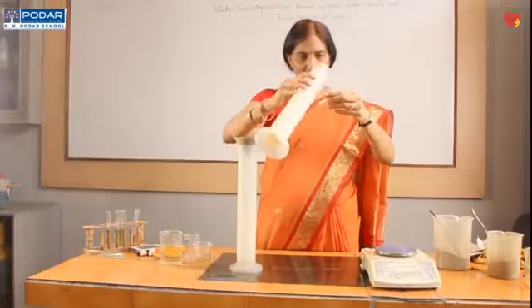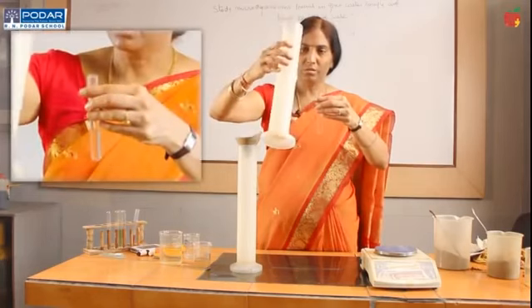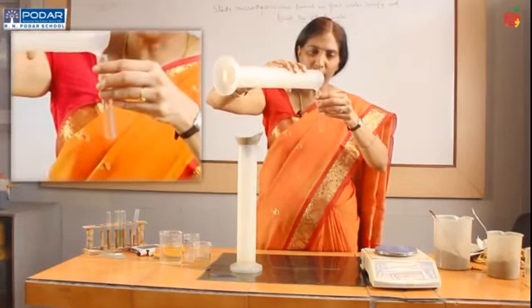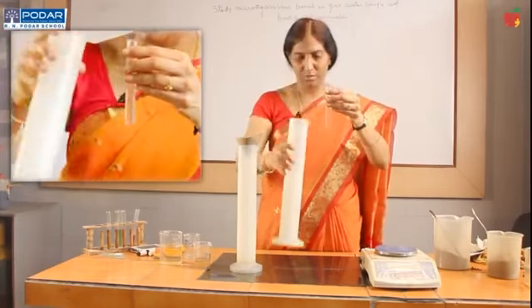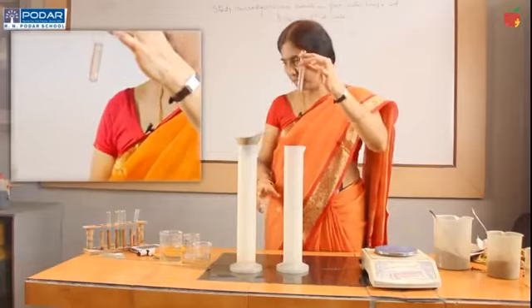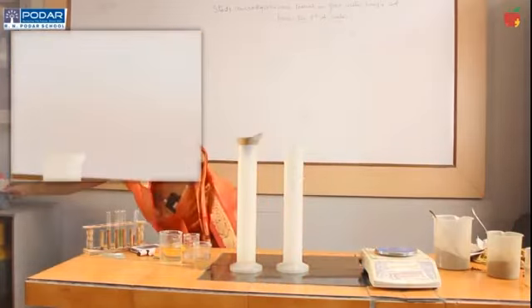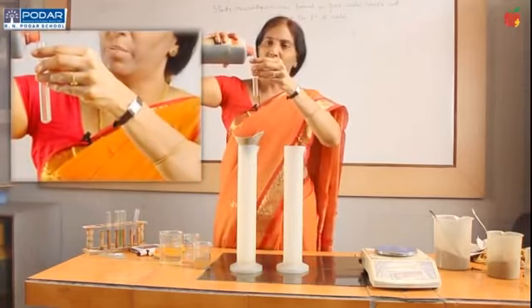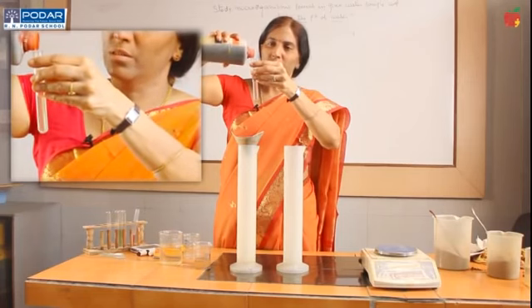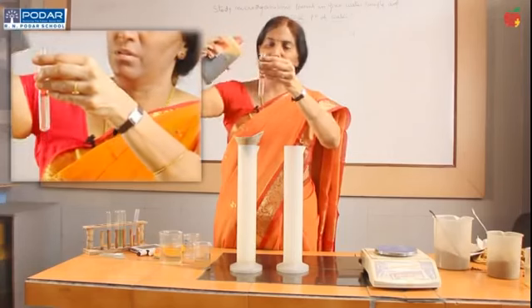Let us start. I am taking a soil solution sample from the first measuring cylinder. I am going to test the pH of this garden soil solution by adding 1 drop of pH indicator, or you can do it with pH paper also.